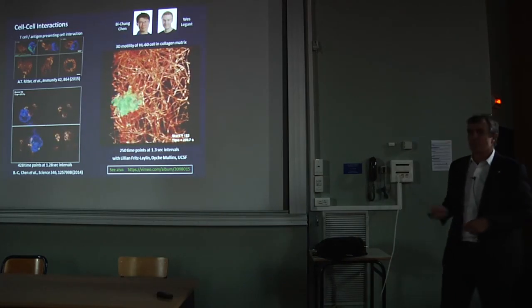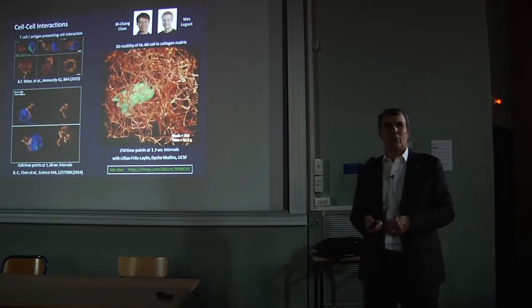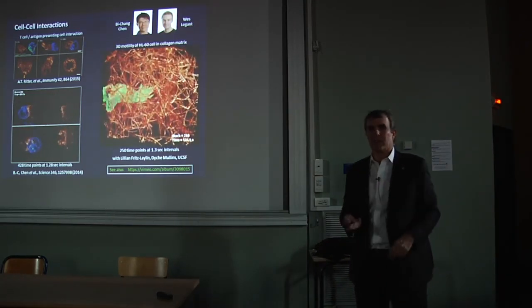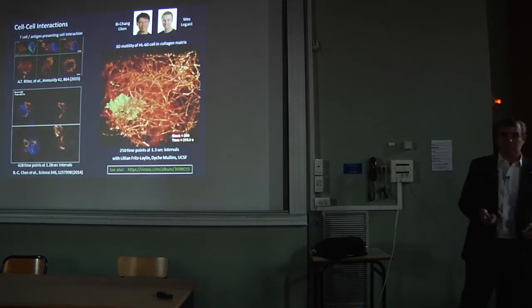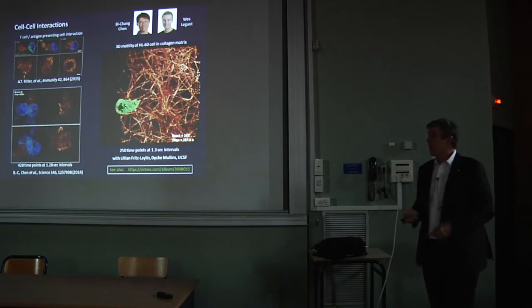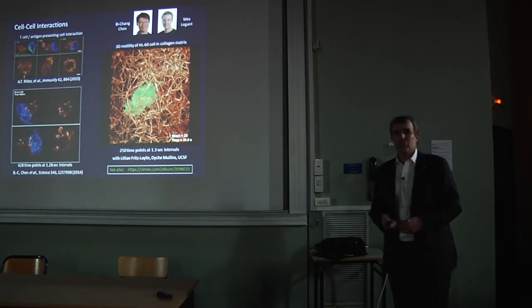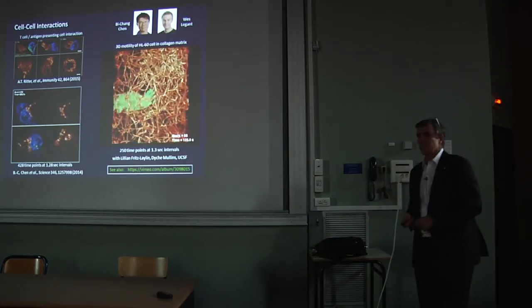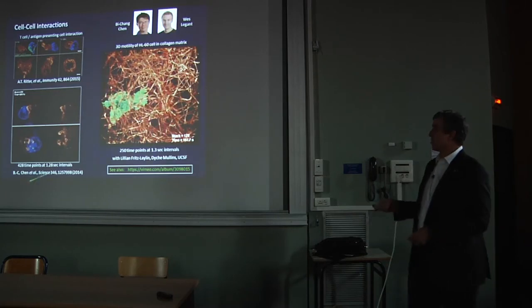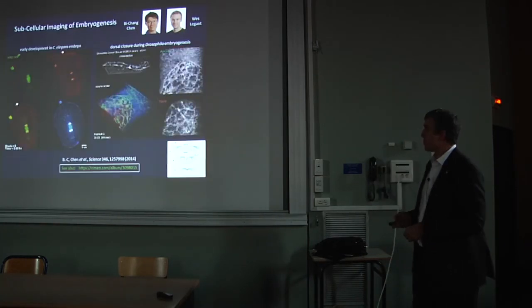Now in this case what you're looking at is 3D motility. Much of what we know about cell motility is looking at cells crawling on coverslips. But if you want to understand cancer metastasis, for example, that's a pretty poor model. So this is looking now in a collagen mesh at a neutrophil-like cell moving in 3D. And so with this, we can finally see the cells in the form they really are as they try to move through tumors.